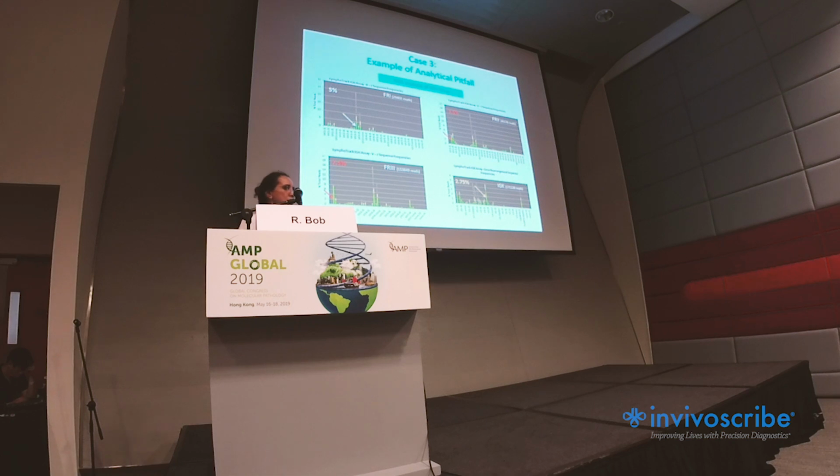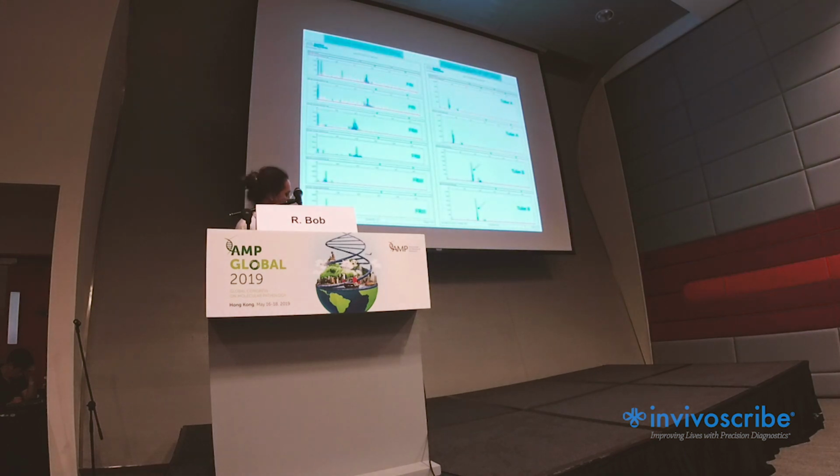So we are not sure, do we have a really dominant clone in an oligoclonal background or not? We apply now fragment analysis, and here we see that especially in framework 3 we have the really dominant peak. However, the smaller dominant peaks are also present. And when we apply Ig kappa, then we have the answer. We have a quite significantly dominant peak for tube B. Why don't I talk about this peak in tube A? I come later to this phenomenon.